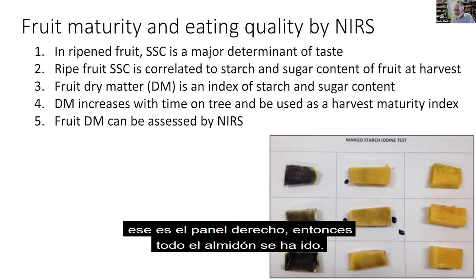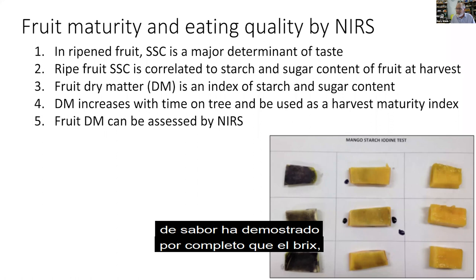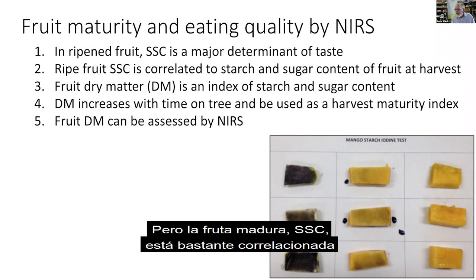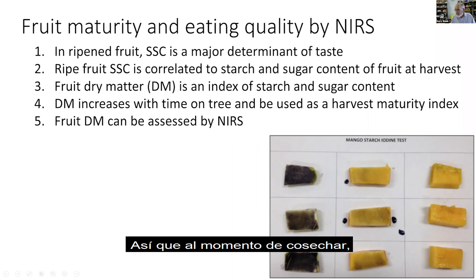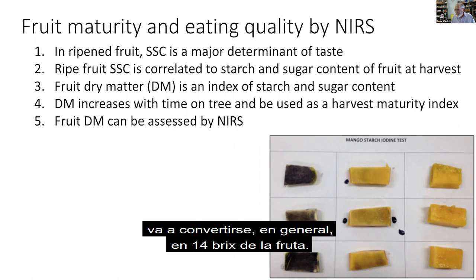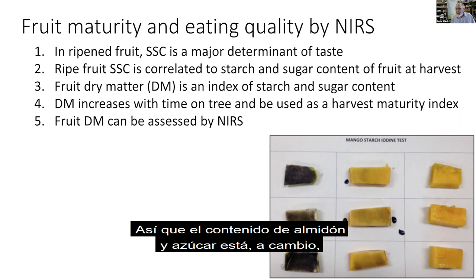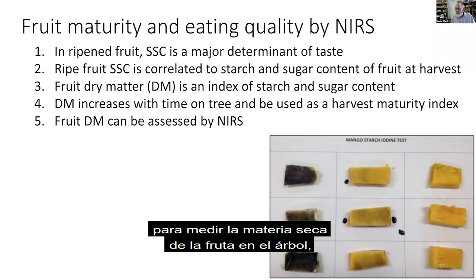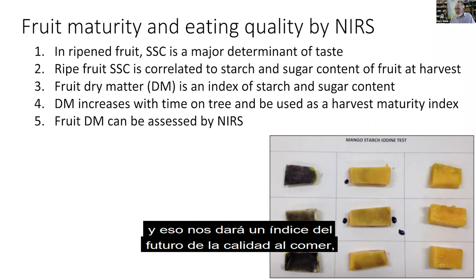So the point to be made there is that the taste panel work has demonstrated well and truly that the brix, or the soluble sugar content, is a major determinant of taste. But the ripe fruit SSC is well correlated to the starch and sugar content at harvest. So at harvest time, all of that starch is going to convert to sugar later. So 15% dry matter fruit is going to become a 14 brix fruit generally. So that starch and sugar content is in turn correlated to dry matter content. So the point being that we can use the F750, F751 to measure dry matter of fruit on the tree, and that will give us an index of the future eating quality, that is the future brix of the fruit when it's ripened.